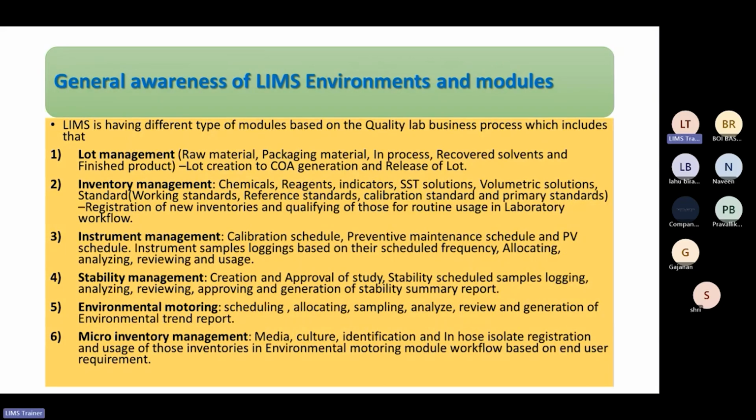Then the different modules available with LIMS, which I am going to explain in further lectures. Just have a look: lot management, inventory management, instrument management, stability management, environment monitoring, and micro inventory management. These are the different modules available with the software, and this is how the end user works with the software.